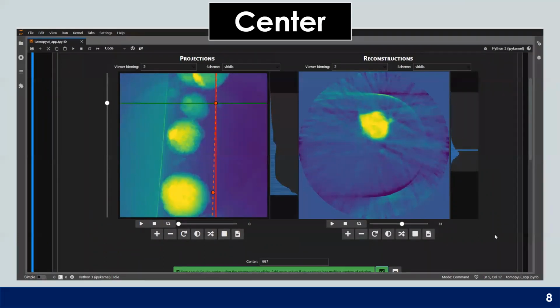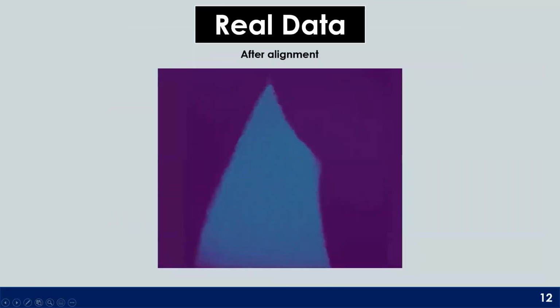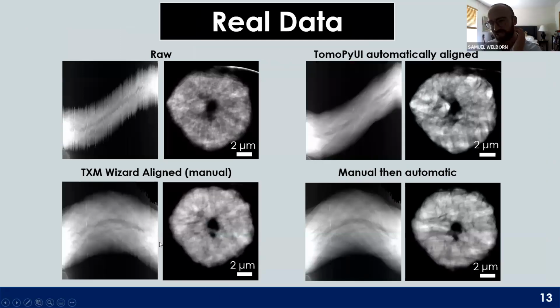Okay, great. Second question is about your slide of the automatic alignment, and also the other example is manual alignment. In practice, how can we evaluate which one is better? Yeah, it's a tricky question because we don't necessarily have a ground truth to this. In the ideal case, you would have a ground truth. For this data set, I don't have a ground truth measurement.